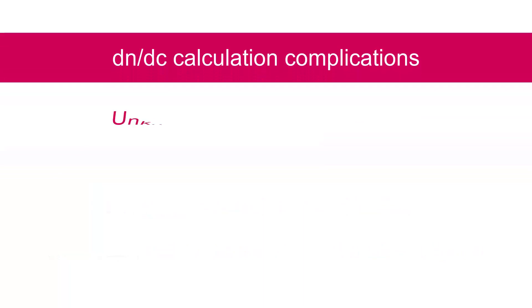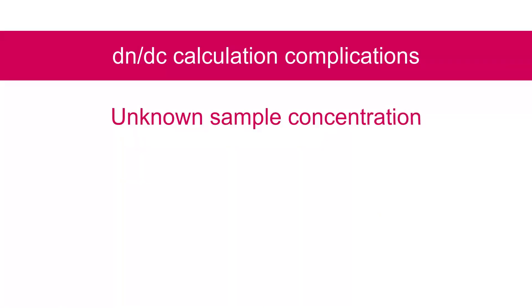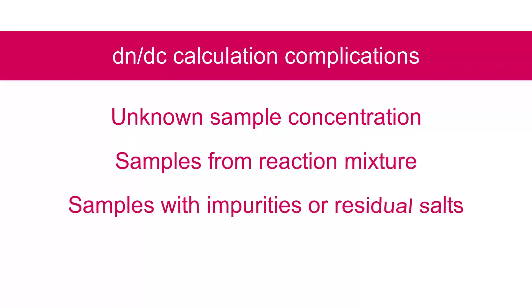Situations where the exact sample concentration is unknown can complicate DNDC value calculations. Examples include samples pulled straight from reaction mixtures, samples with impurities or residual salt present, and partially soluble samples.